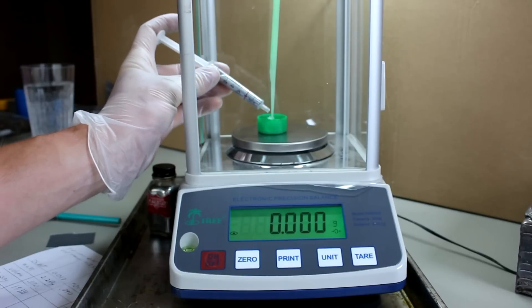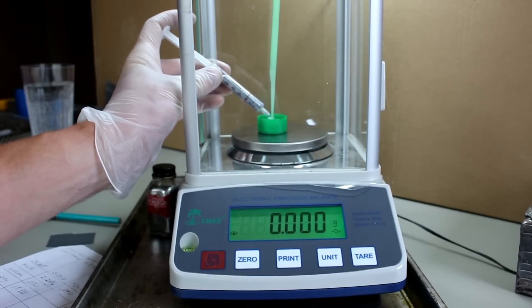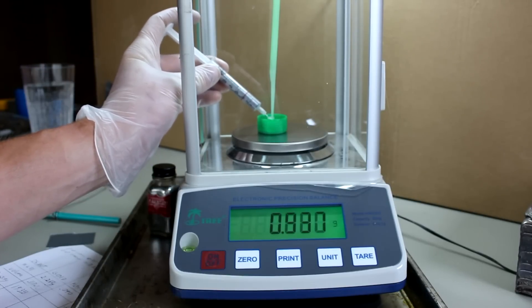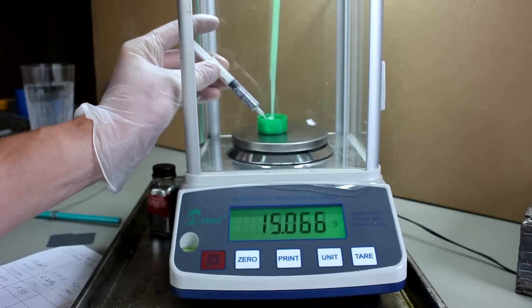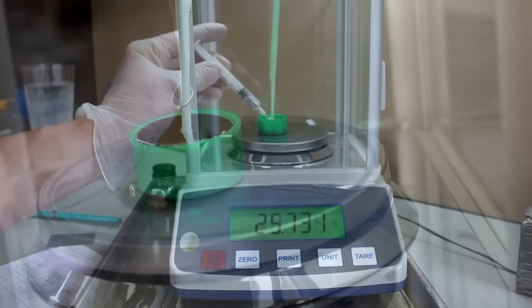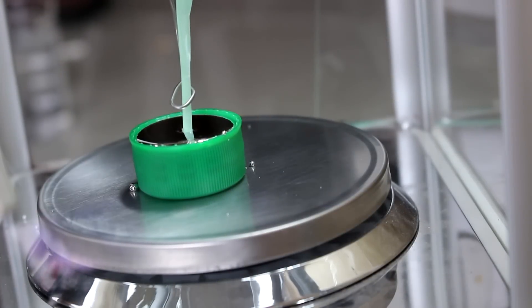So here it is the densest room temperature liquid known to man, mercury. Well I suppose mercury with gold dissolved into it would be slightly heavier. So now that I've got the straw positioned inside the mercury I'm going to tare that to weight.